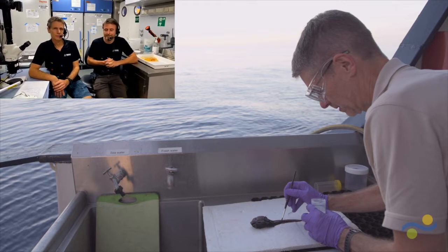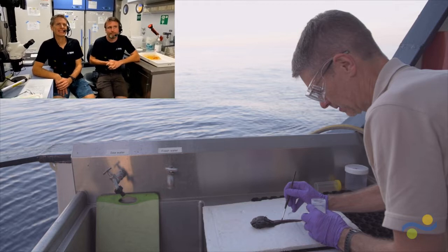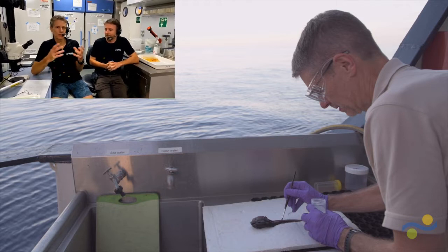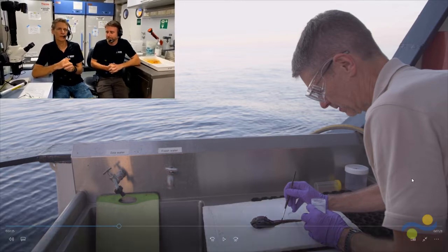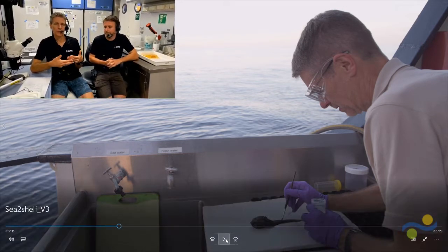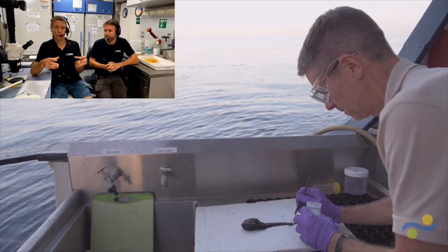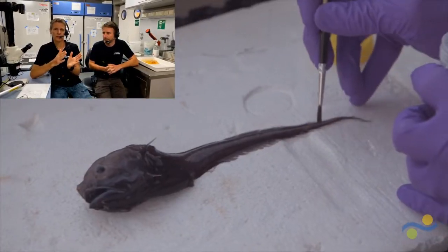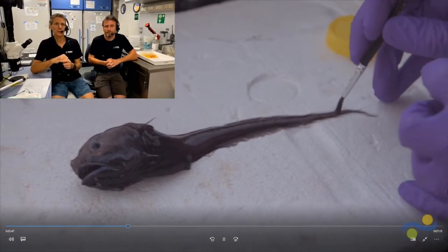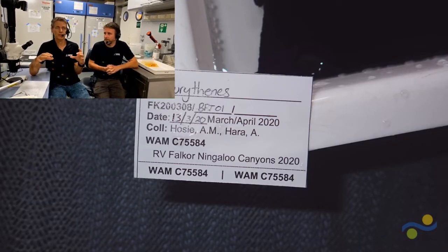Wonderful. So I've paused the video here. You are actually out on our aft deck, and it looks like you are painting this fish. What are you actually doing to the fish? So the fish have fins, obviously, and usually when we preserve fish in formaldehyde, which is the typical preservative medium that we use for vertebrates, one of the problems with just dropping it into a pool of formaldehyde is that the fins usually collapse. As you can see there on the screen now, I'm just using a paintbrush and concentrated formaldehyde. I try and tease the fin rays out and paint them out into a natural state as much as we can.